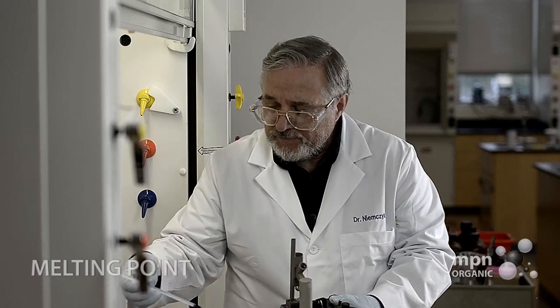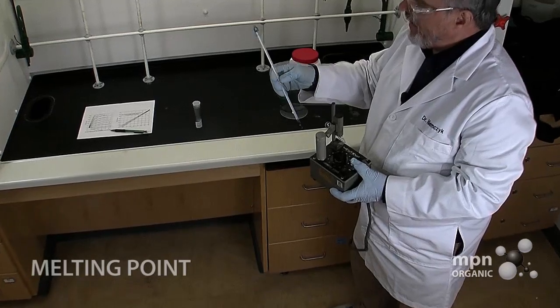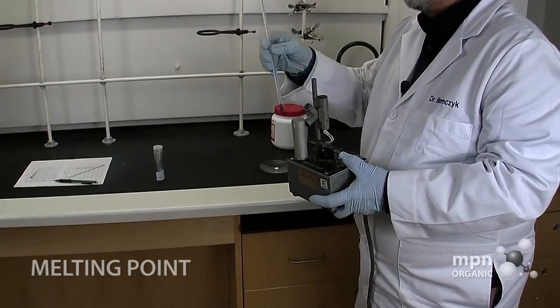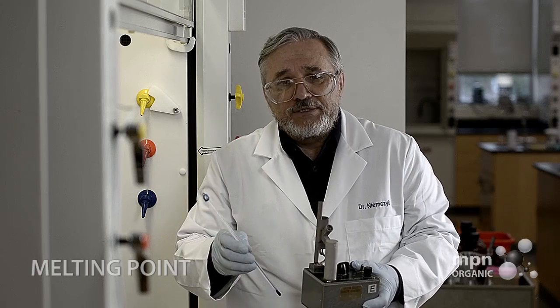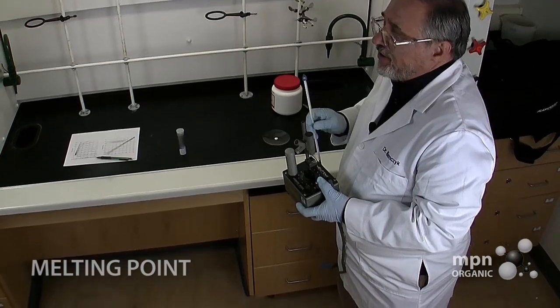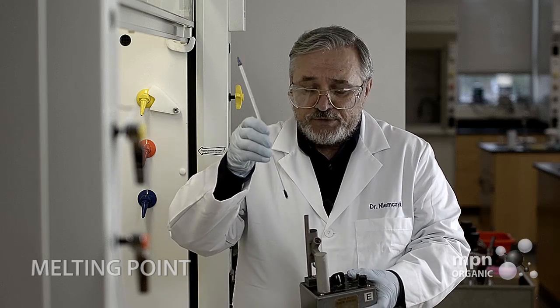But it's important that you get the right thermometer. Now the thermometer that I have has a range of between -20 and +150. Obviously we don't want to go outside the range of the compounds that we're looking at the melting point of. In fact, this one goes up to 150. The transcinnamic acid is going to melt at about 133. So we're within the range.